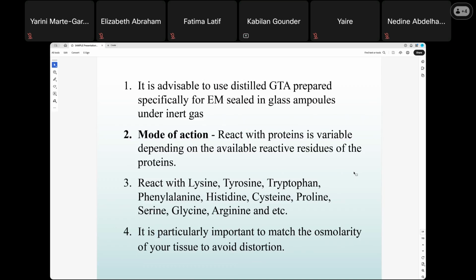So for 1 week or 10 days, you can temporarily keep it fixed. The third one is -20. You can keep your samples for 2-3 weeks at -20. It won't spoil. So that is the strategy here also.